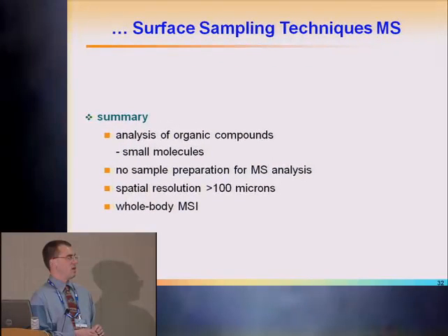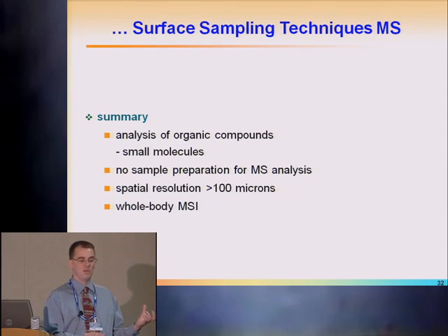It's being used for small molecules. Again, there's no sample preparation. The spatial resolution is clearly more than 100 microns. It's more like millimeters. But if you look for quick answers on a whole body, the question: is it in the brain? Is it in the intestines? Is it in the heart? Is it somewhere else? This is the technique where you get data with a quick turnaround.